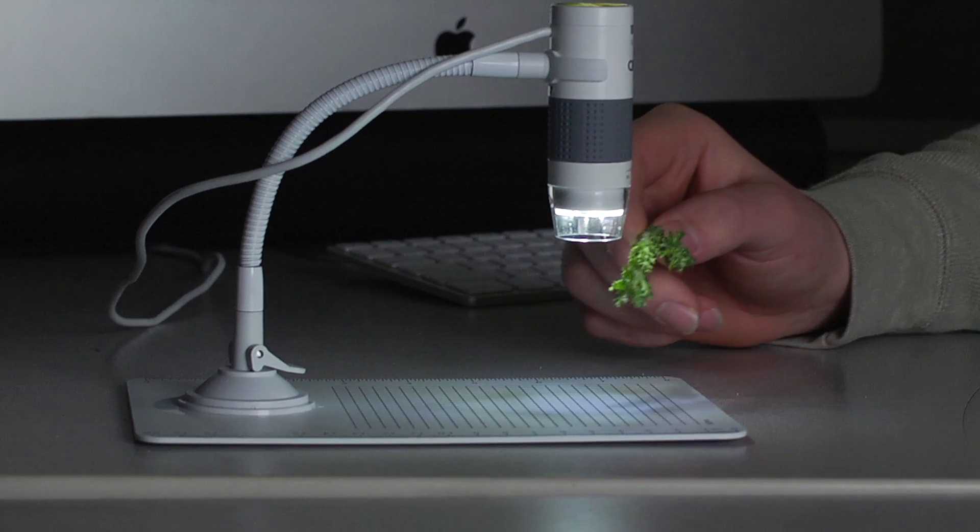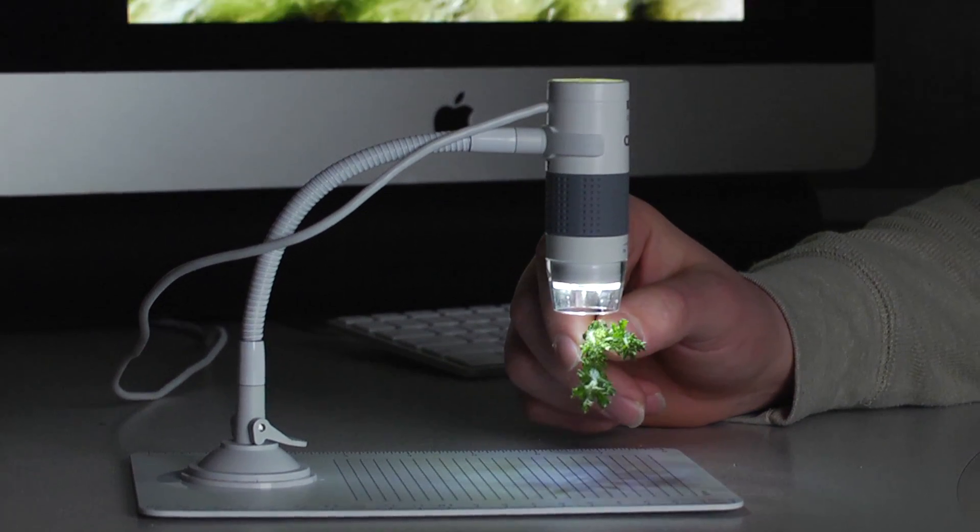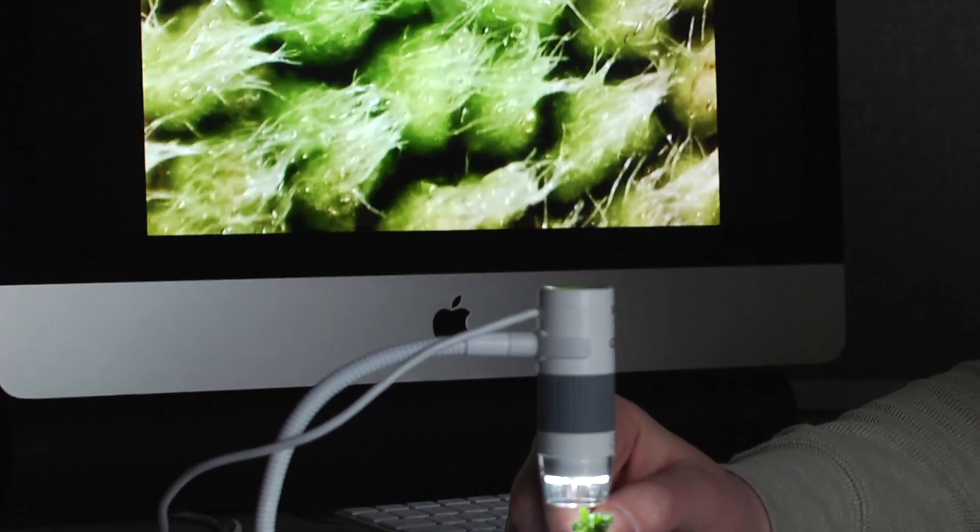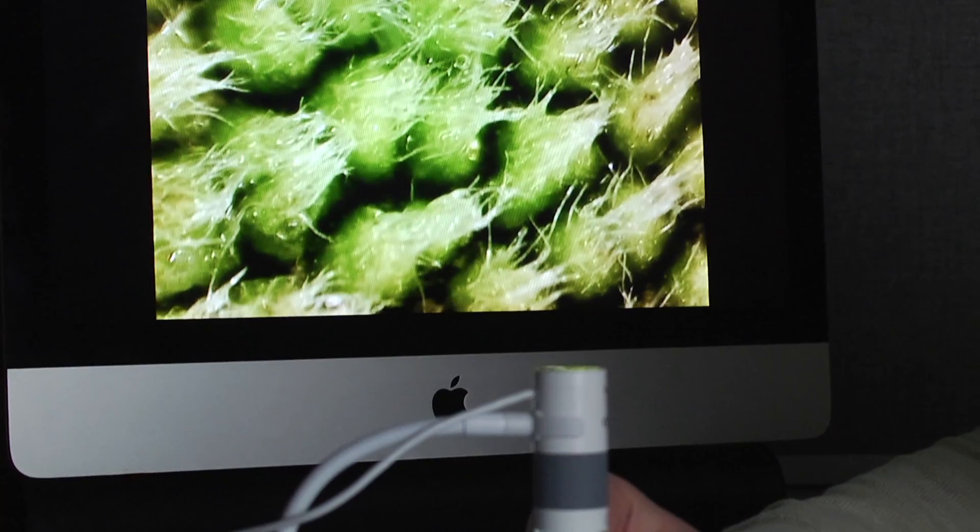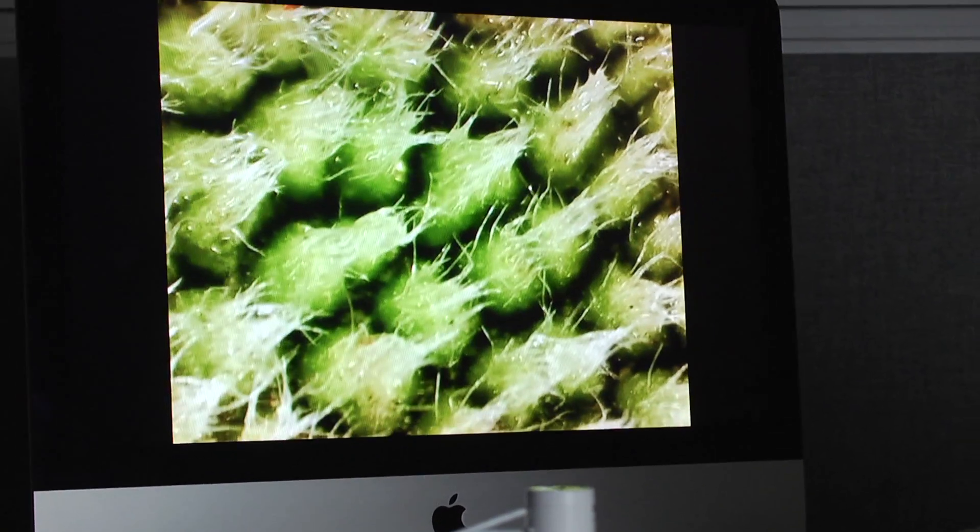If you hold an item right up against the lens you can get a view of up to 300 power. With something this powerful you can see details on any type of plant life.